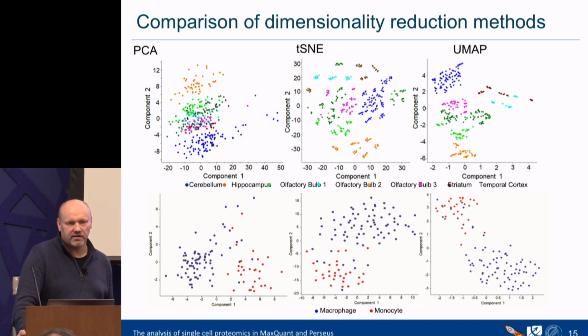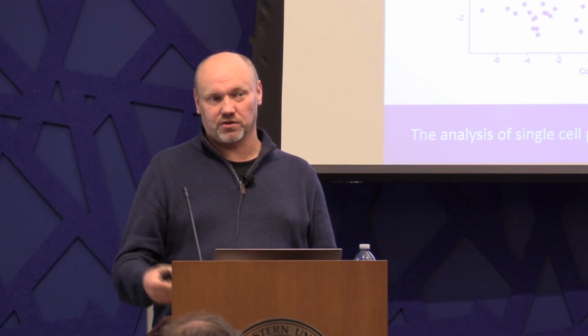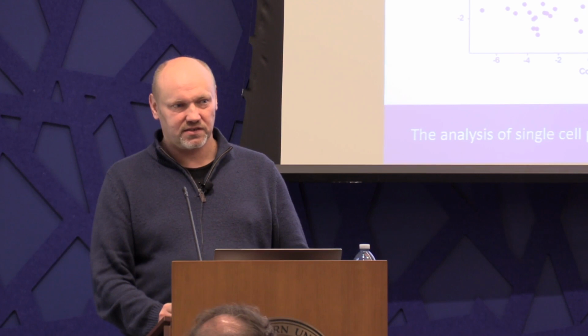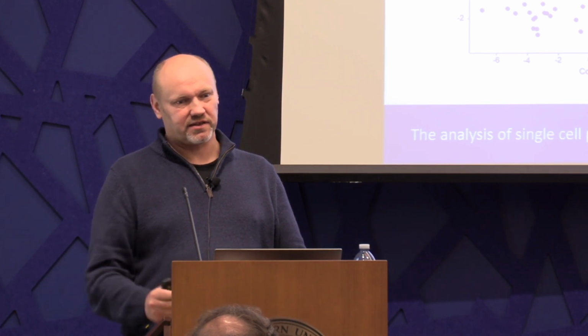So they're all there. Maybe you remember we are creating this Perseus tool to give everybody the ability to analyze the data. That's the idea. So you don't need a proper education in statistics or something like this. That's the goal, and these people can now do exactly these things with the next release.